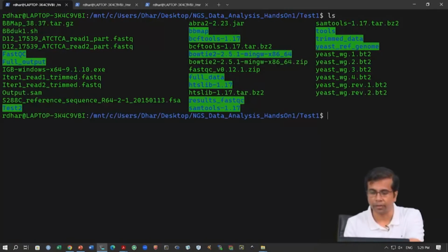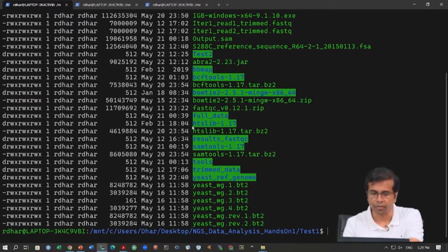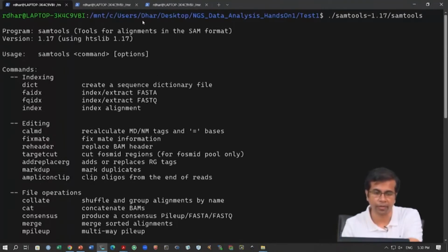Again you can see these folders. One is this BCFtools folder here, and you also have the SAMtools folder. Inside these folders you have these programs, SAMtools and BCFtools, which you can use for running all sorts of commands. So I will just run this, and it will give you all the options for how to run these commands. So you can see the usage, as before.